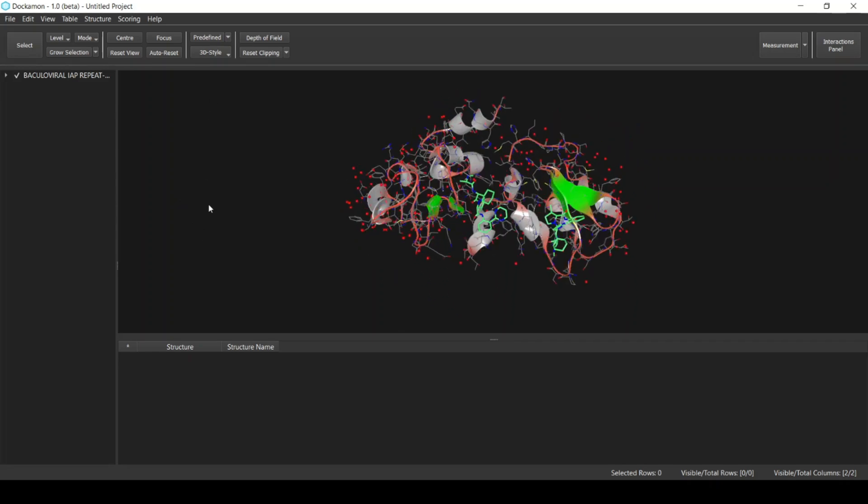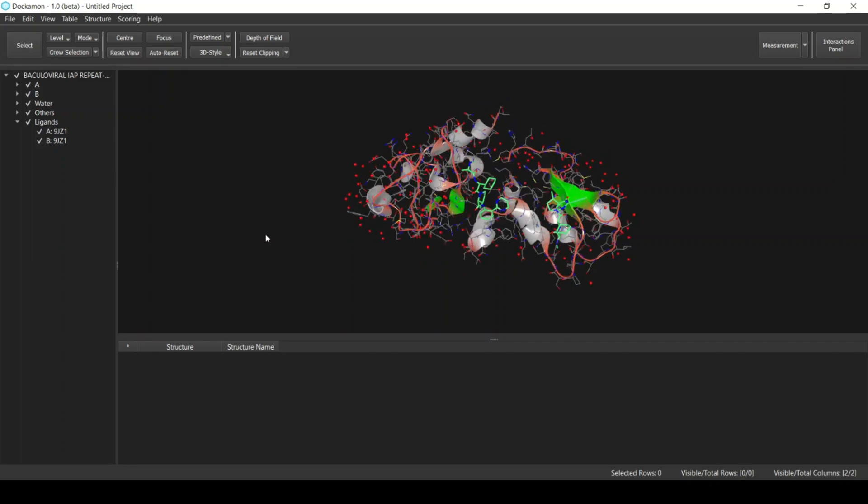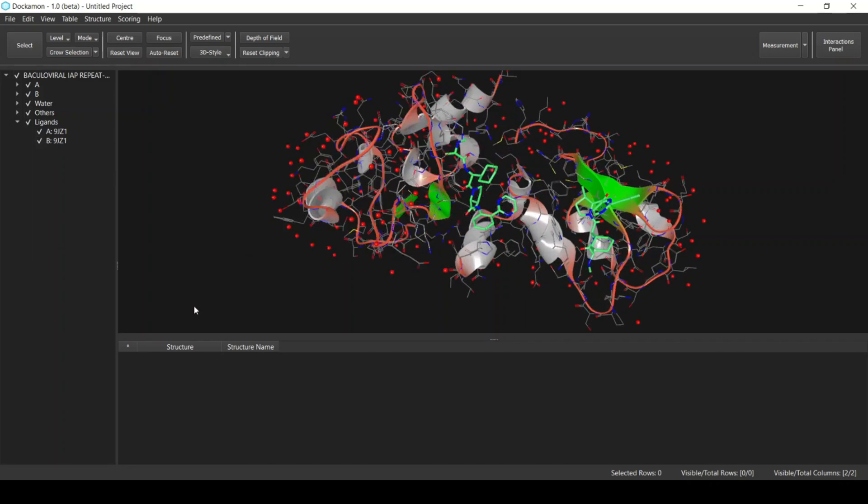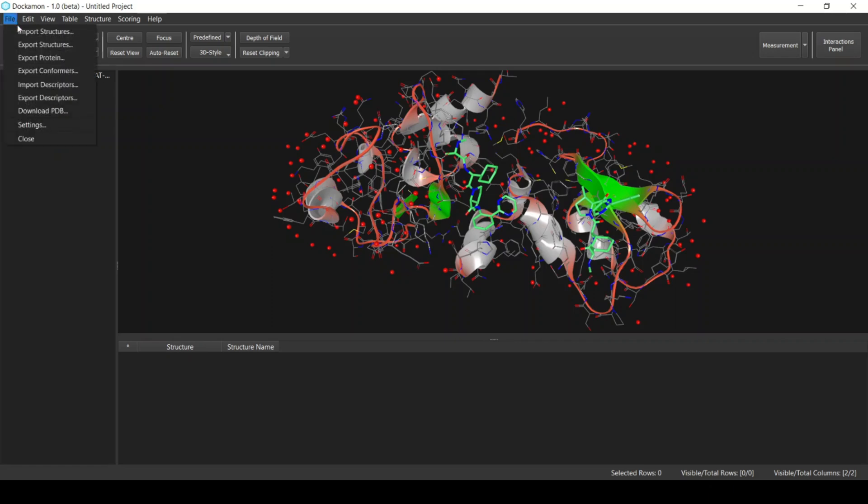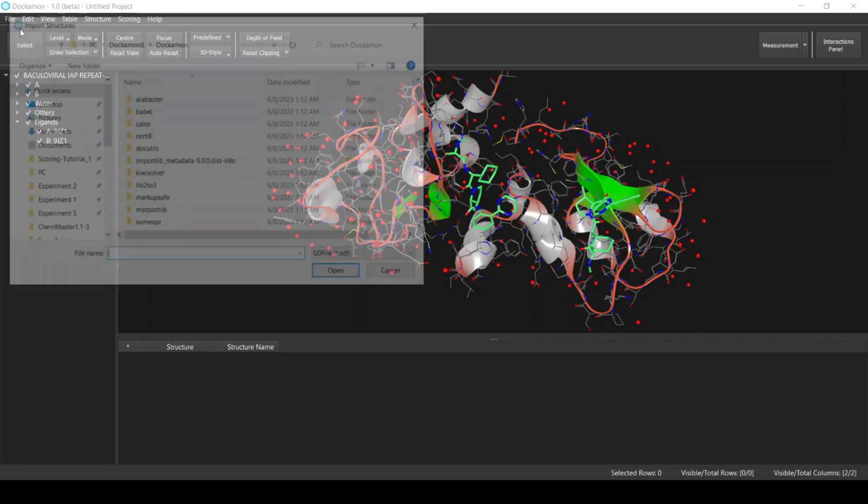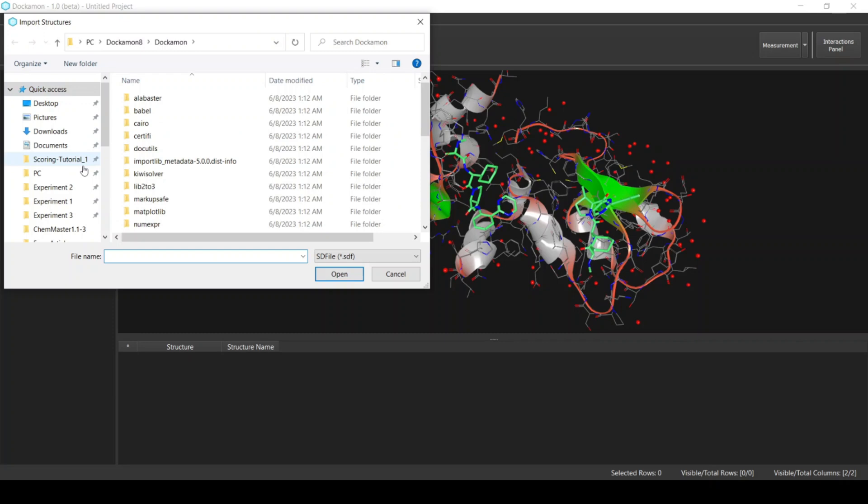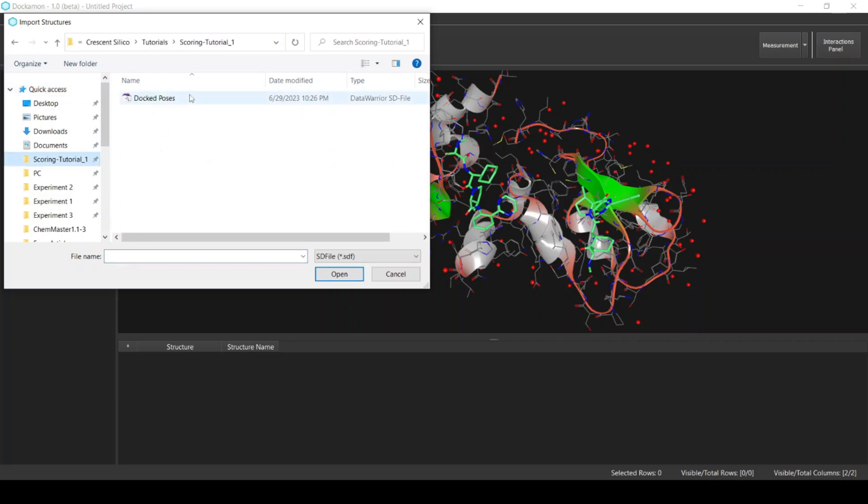Now the structure of the target has been imported in the software. We can see the target here and also we can see the parts like the chains and other parts such as the ligands. You can see it has two native ligands present in it. Next I will import the ligands. Again, from File, select Import Structures and select the docked poses SDF file. Click Open.